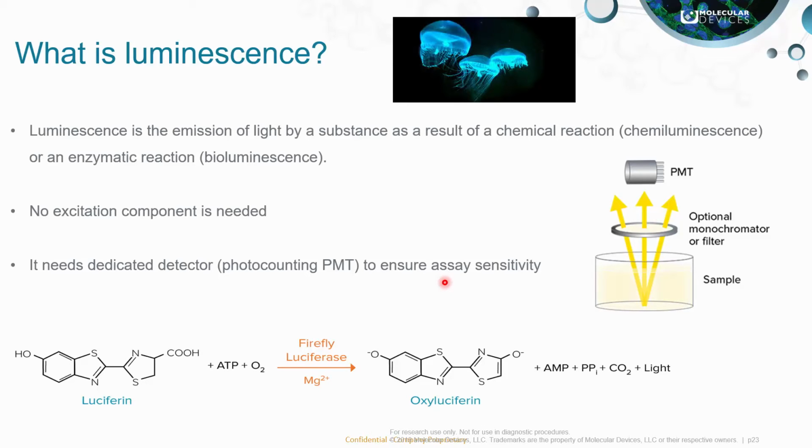Below is an example of a chemiluminescent reaction. On the left-hand side of the reaction, you have your reactants, which are catalyzed by firefly luciferase, and in turn producing products and light.